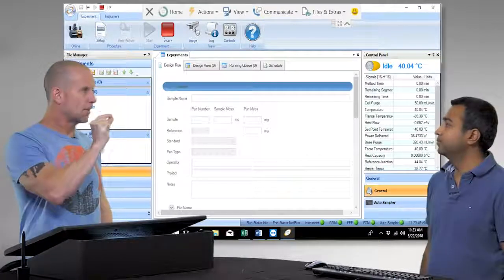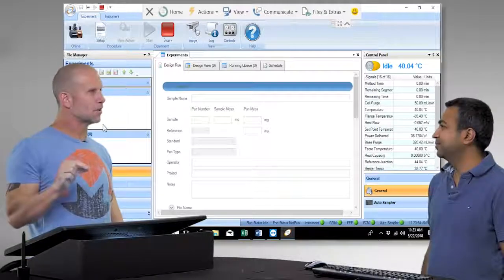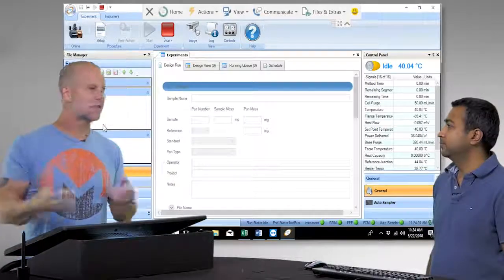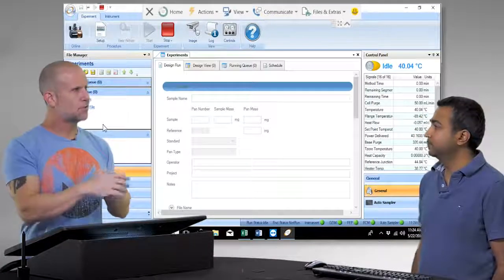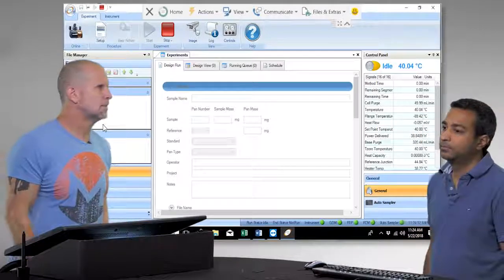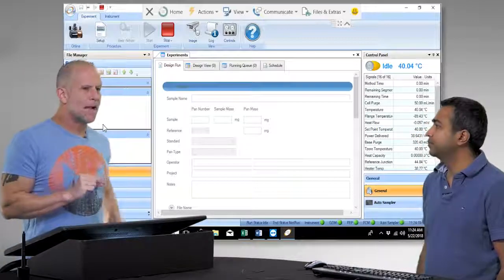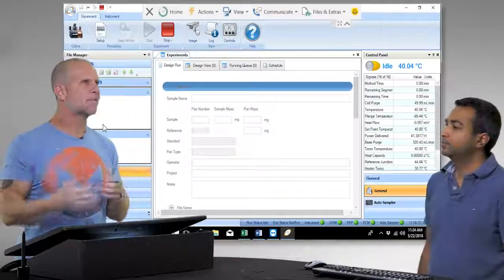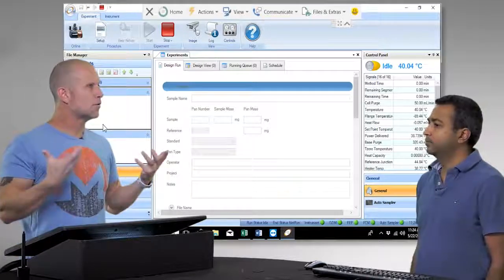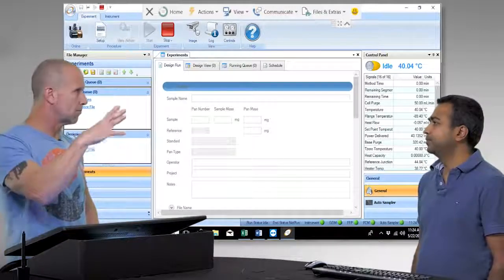We've taken a small sample — five milligrams is just a speck. We usually use a little wire and cut the smallest piece of indium wire and put it in. We hermetically seal it, which is a pressure seal. These hermetic pans used by TA have a total volume of about a couple hundred microliters. A hermetic seal allows internal pressure of several atmospheres — three or four — before it'll break that seal. You can almost always tell if internal pressure has expanded because the pan bulges, which actually affects your experiment.